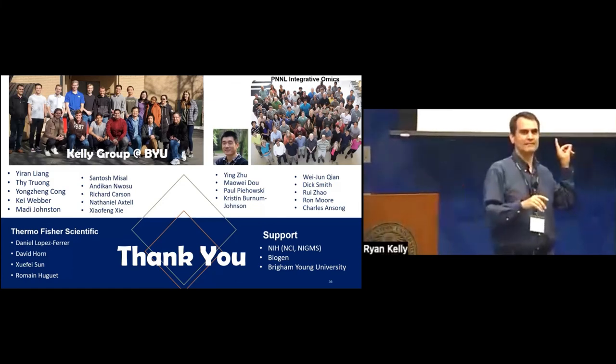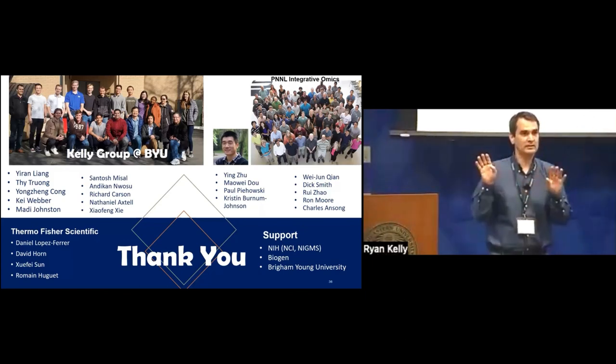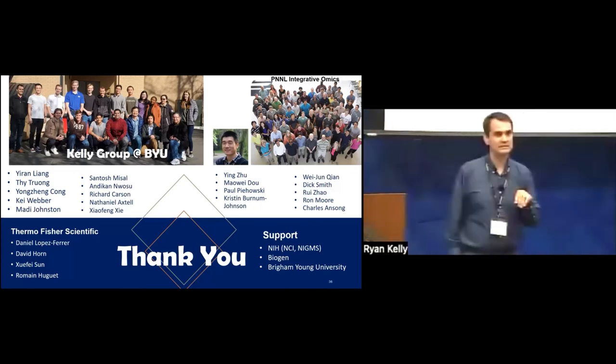I should say, I think everything else we showed in here was with the Orbitrap Exploris 480, but the TMT stuff was done with the Eclipse.